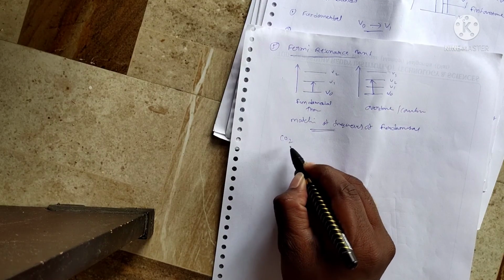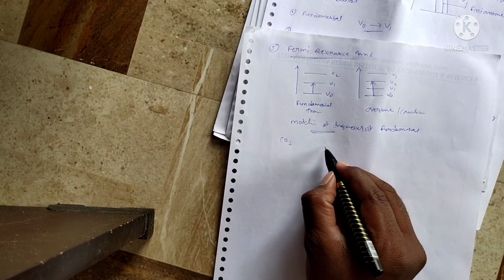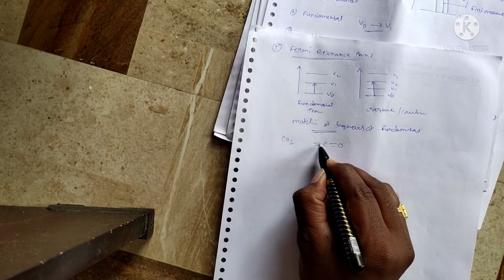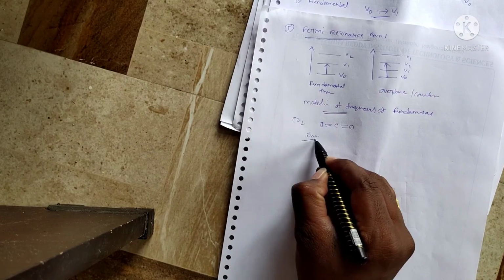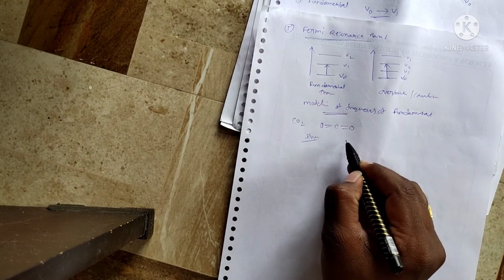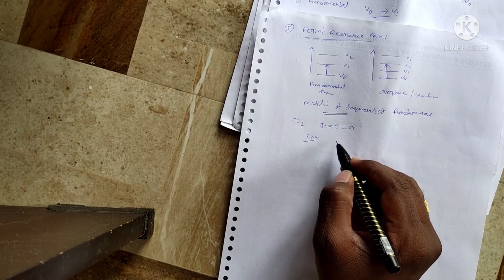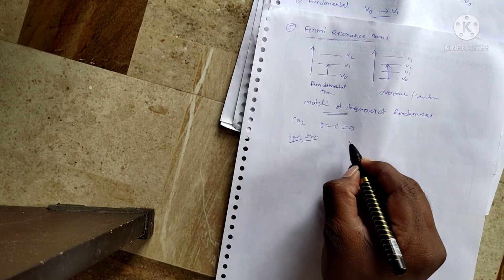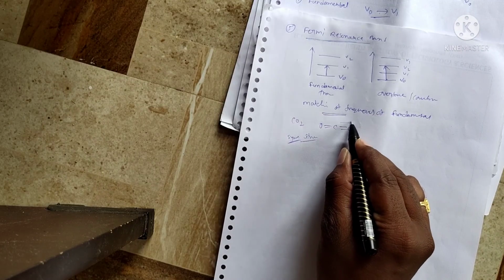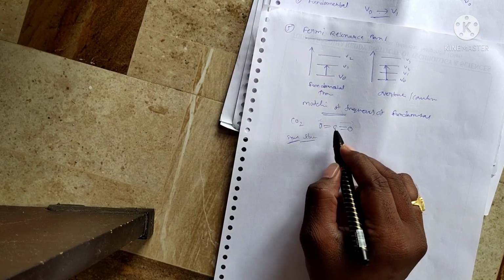Consider the example of CO2. The CO2 molecule is a linear molecule, and already we know the stretching type vibrations. Stretching means symmetrical stretching.